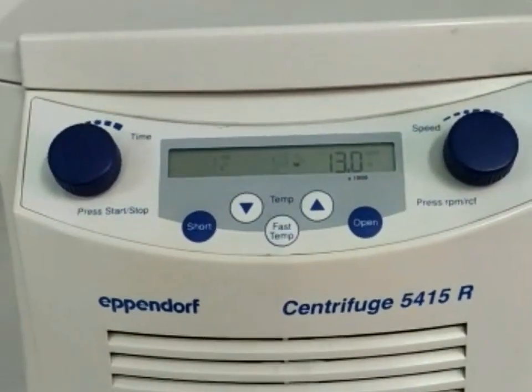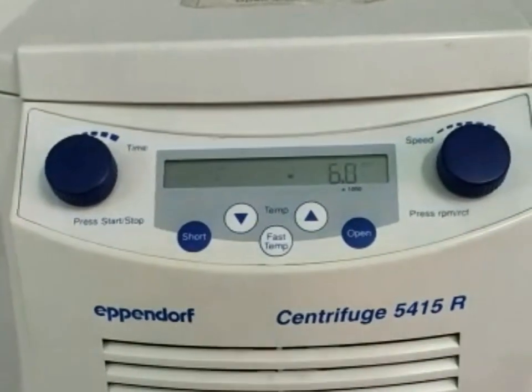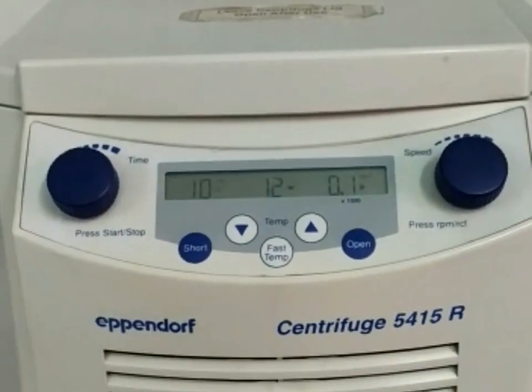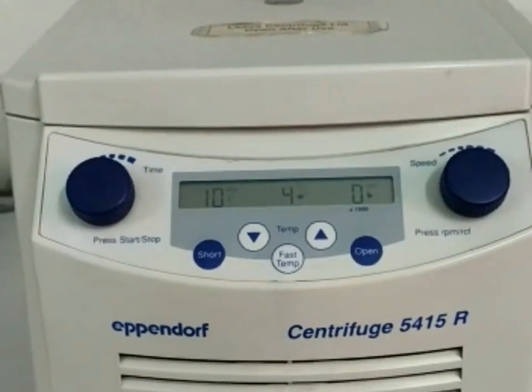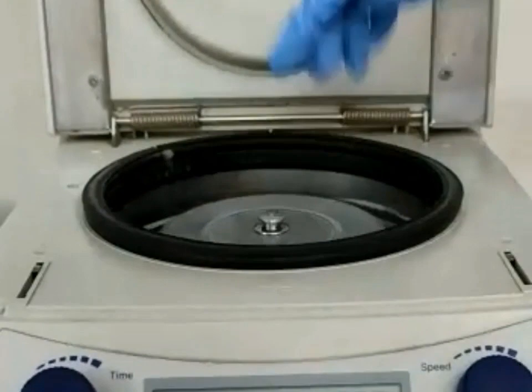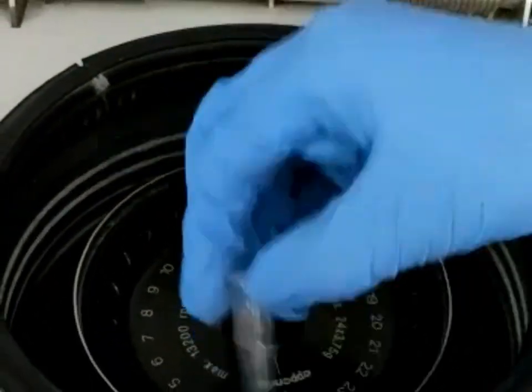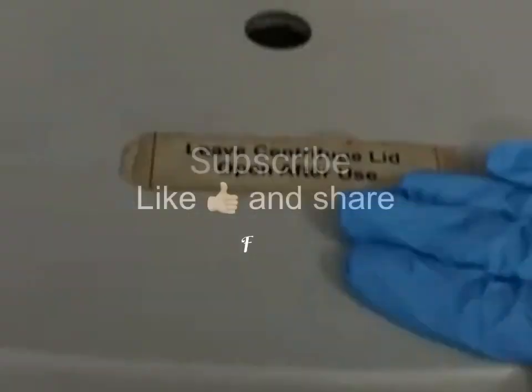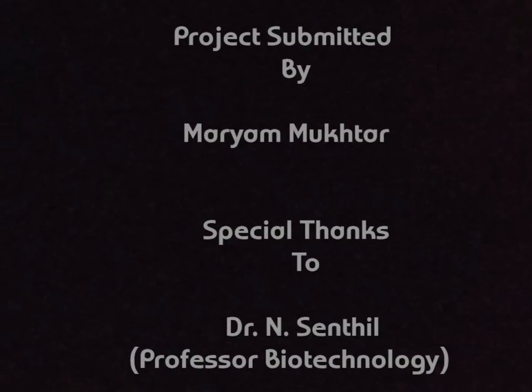After the required time is reached, the centrifuge will automatically stop. We can then take out our samples by pressing the open button, removing the samples, and closing the centrifuge.